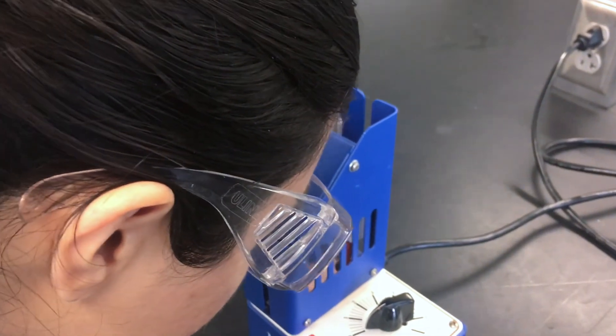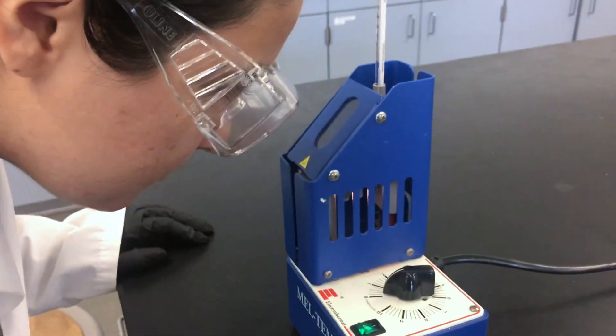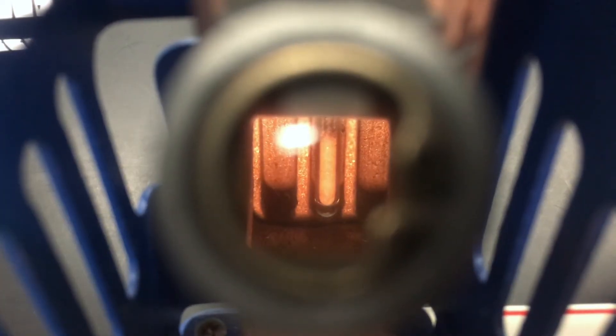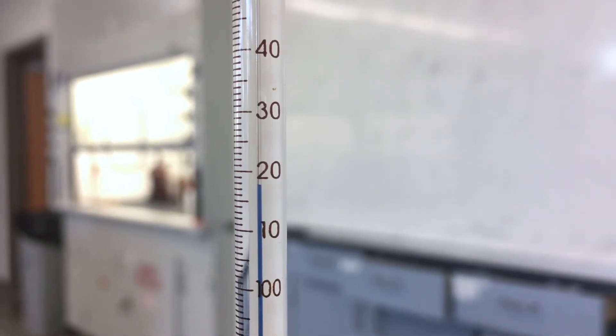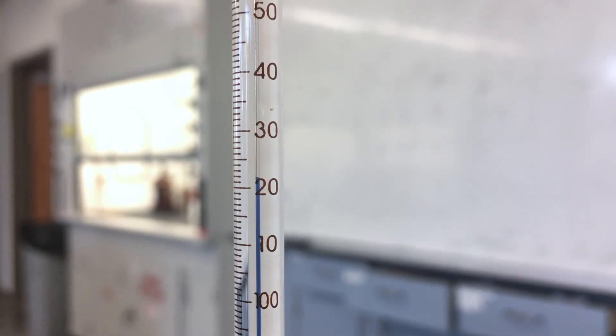As the device ramps the temperature up, take note of what temperature the thermometer reports when the substance begins to melt. This is the lower bound of the melting point range. When the substance has completely melted, take note of the temperature again. This is the higher bound of the melting point range.